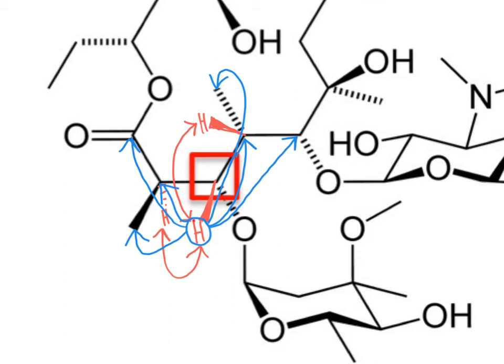So 1 bond to get from hydrogen to carbon, 2nd bond is carbon-carbon, 3rd bond carbon-carbon there. So that would represent the extent of our 3-bond correlations. And again, much like with the COSY experiment, we generally don't see correlations that span through this heteroatom here, be it an oxygen or a nitrogen or whatever else there. So we wouldn't necessarily expect to see a correlation over to here, generally speaking. We could also potentially see 4-bond correlations. So if we continue over this way, we would find a 4-bond correlation over to here. That correlation, much like the earlier 4-bond correlations, is often very weak or non-existent, so that's why I'm highlighting that one in yellow.